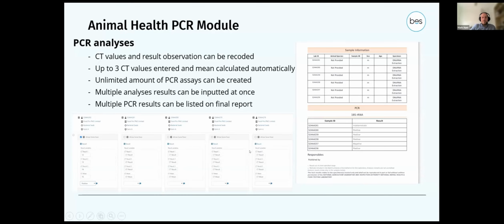And we've got 5 samples here that can be entered at once, and they can all be saved, submitted, and verified. And then we can show these same 5 specimens all on one report here. So you don't have to have an individual report for each sample. And you don't have to report all the results, but you can choose whichever ones you want. There may be the positive or the clinically significant results, and then have that on the final report for the consigner to look at.